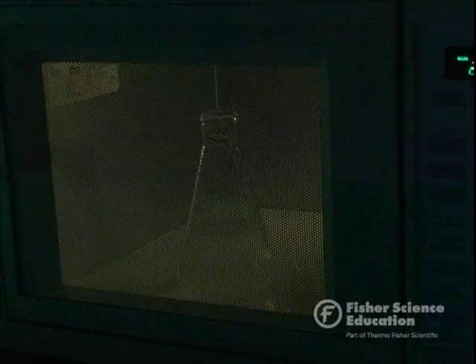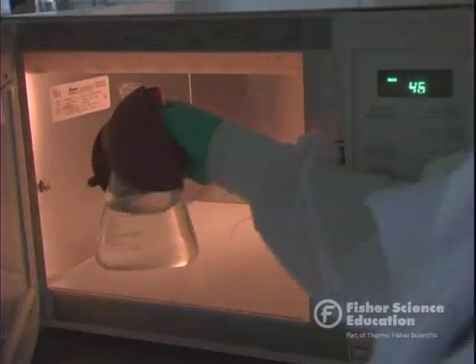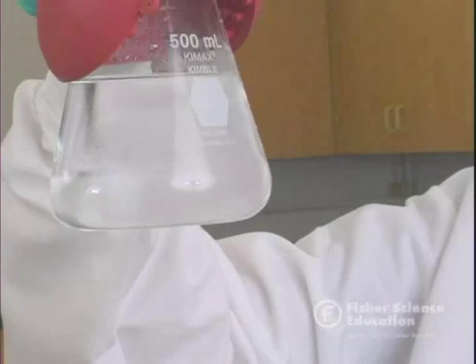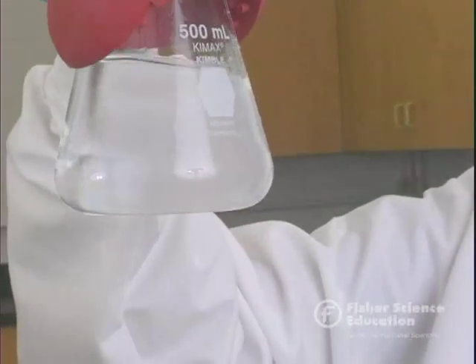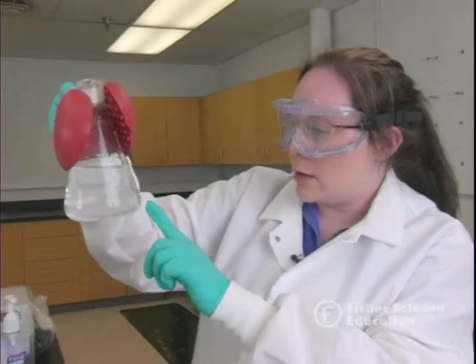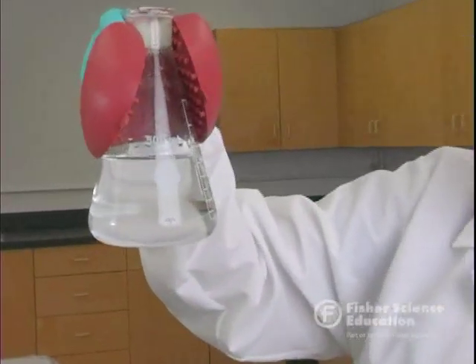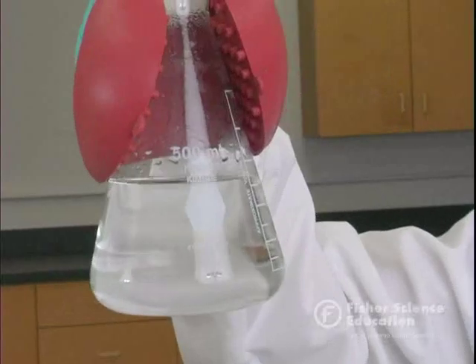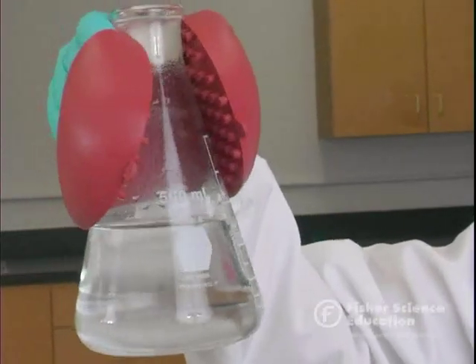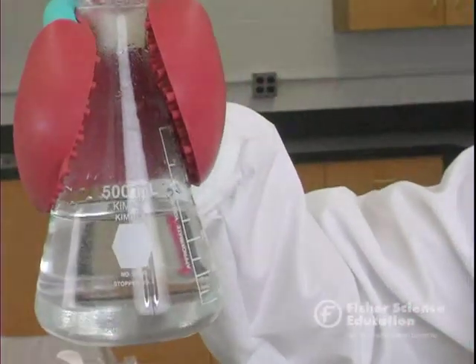For your first microwaving, you're just going to microwave it until it boils. Watch in your microwave and as soon as you see it start to boil, take it out and swirl it so it can mix and heat evenly. You'll need to microwave it until every last small crystal has dissolved. Depending on the amount of agarose, it may take anywhere from two to six minutes. One tip to help prevent evaporation is to stick a tissue or chem wipe in the mouth of your flask.